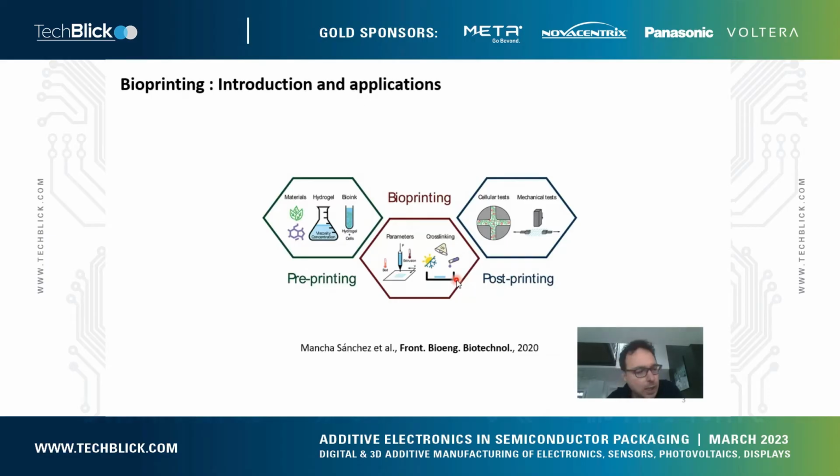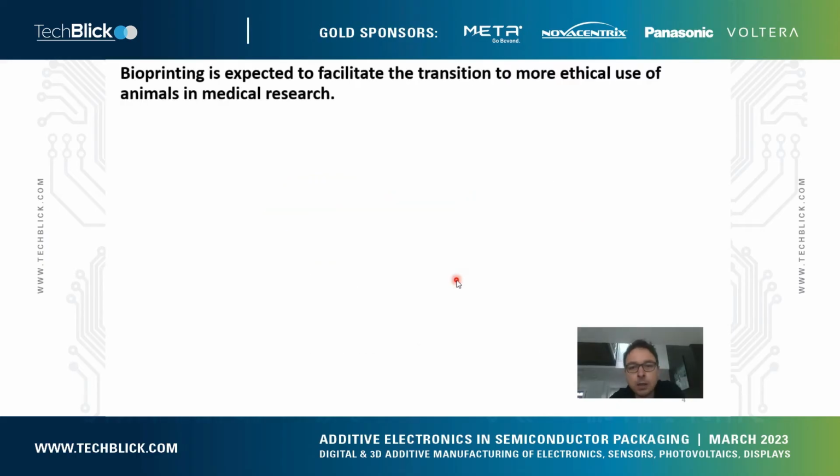So it's how are we going to make our printed structures gels so they can have essentially a 3D shape. And then we have different ways to do so. It's either photo cross-linking, chemical cross-linking, enzymatic cross-linking, or temperature-based cross-linking. And then post-printing steps, where we test functionality of our printed constructs.